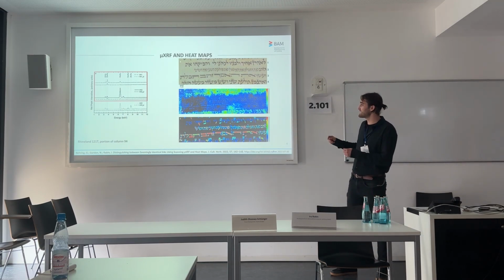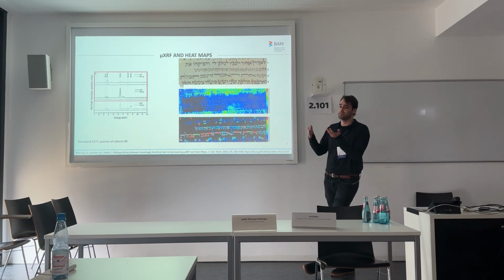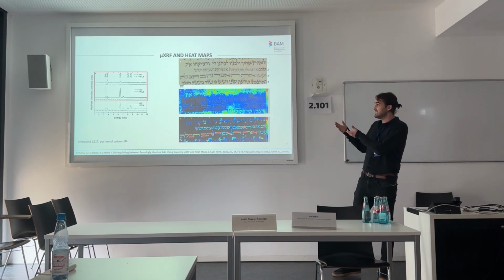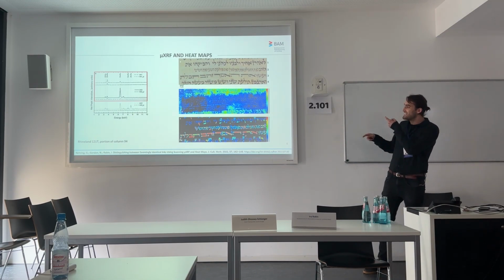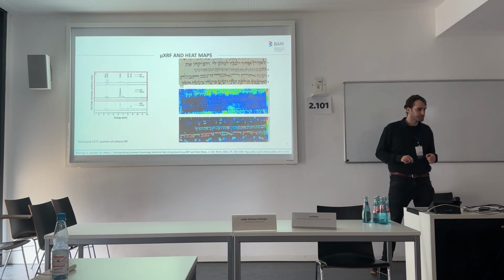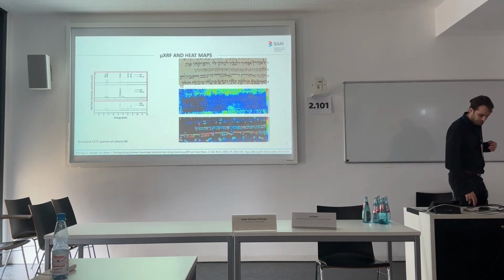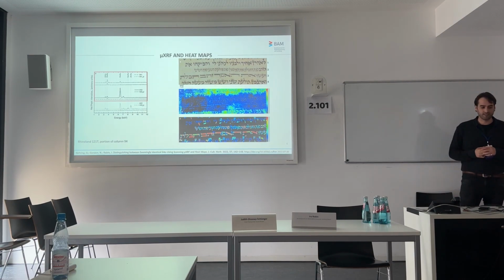added. More than that, when we look at the crowns, we see that all of those were also added to the existing text. In this way, even though the inks basically contain the same elemental makeup, we clearly see how those different stages of writing were executed. This technique, in cases like this, requires a couple of hours to perform a scan.